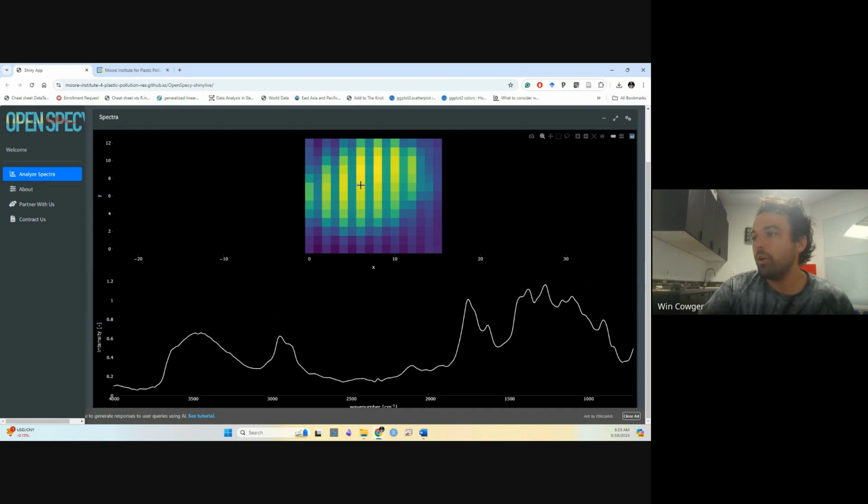Now, when we're over a particle, there's not just atmospheric information. There still is atmospheric information, but now there's also particle information. And so now you start getting that particle information, you have even more absorbance in that column where the measurement is being taken. And this is because of the Beer-Lambert law specifically, which basically states that you're going to have higher absorbance where there's more thickness to your particles, right?